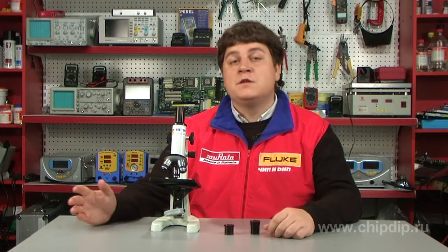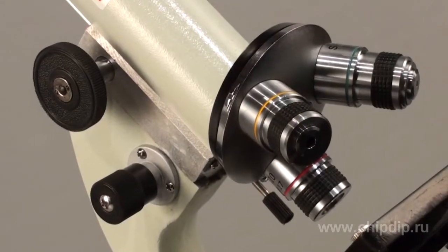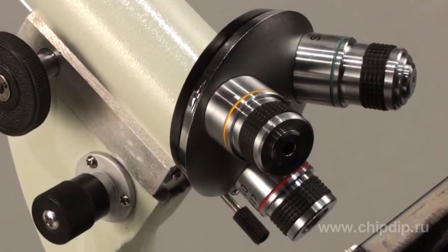For example, it can help to study biology, chemistry, or physics. The microscope has two eyepieces with 1:10 and 1:16 zoom ratios and three lenses which provide 1:4, 1:10, and 1:40 zooming.